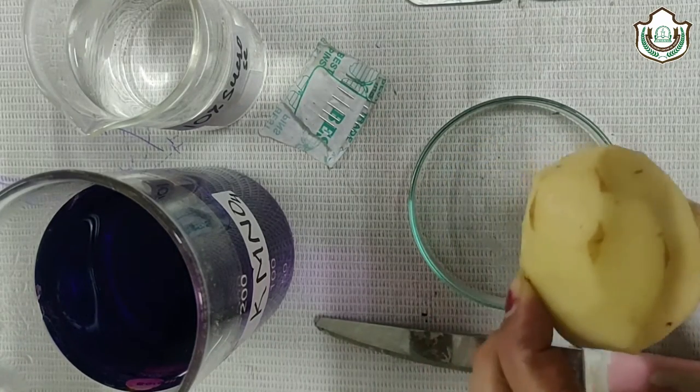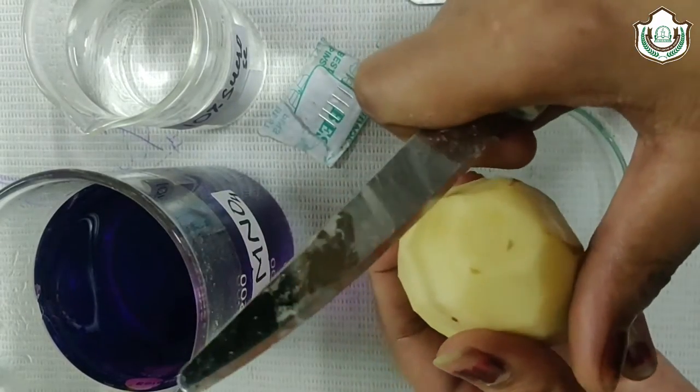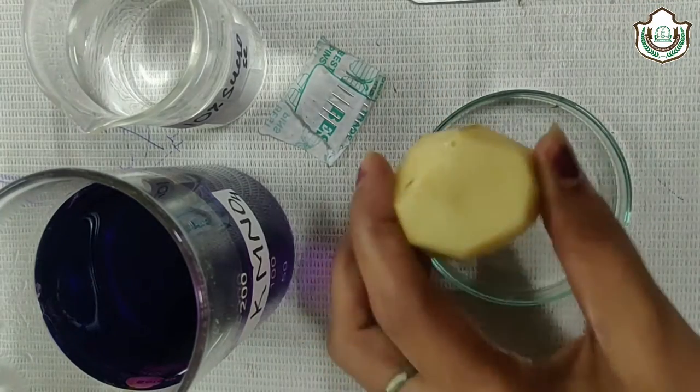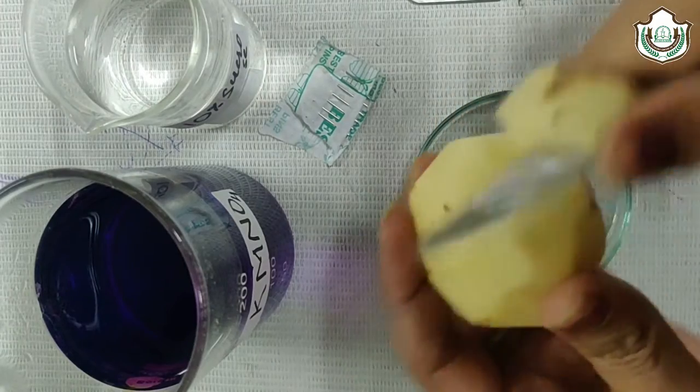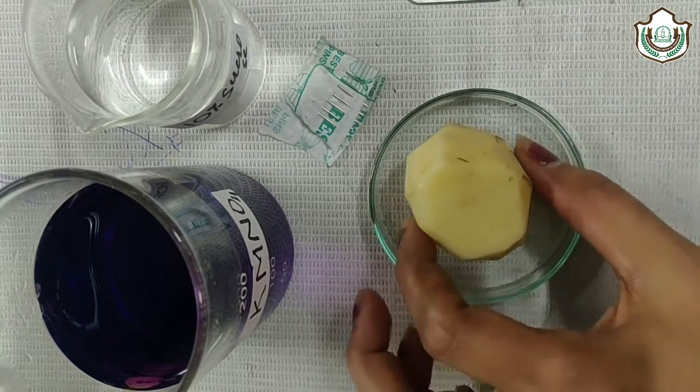Now first of all, we have to cut the base of potato like this, from both up and down side, and place it in a petri dish.